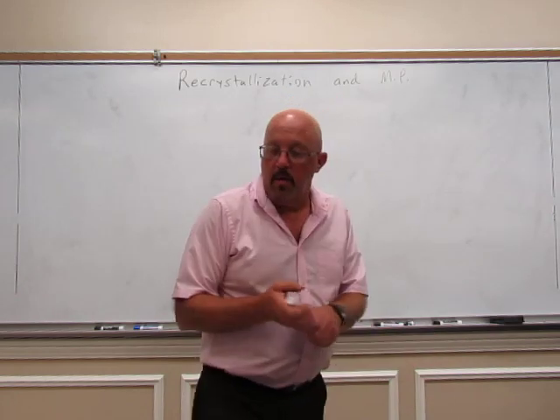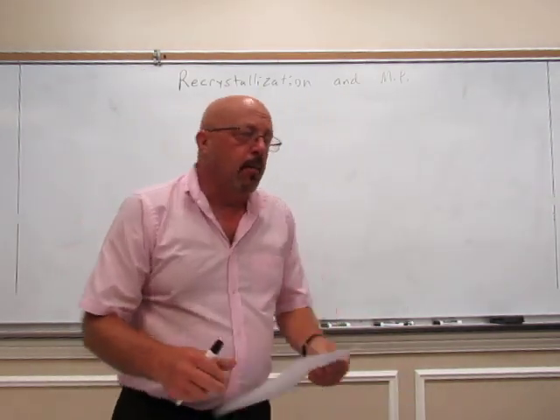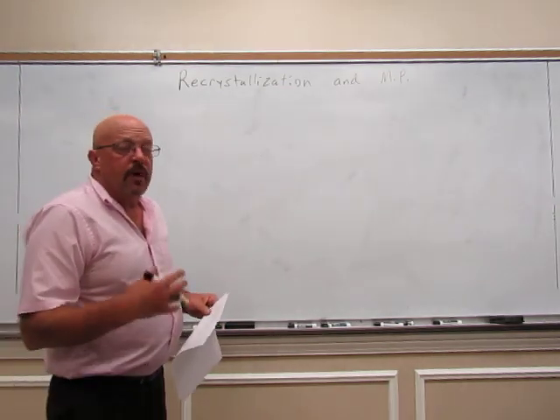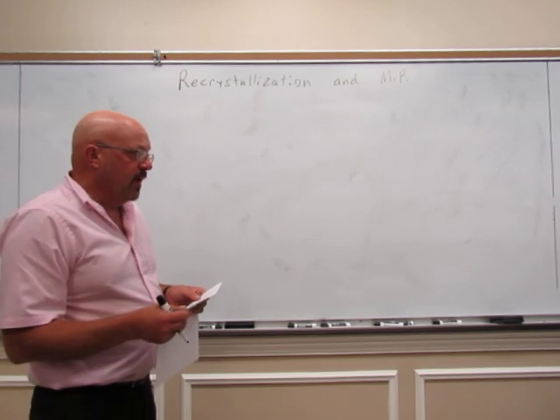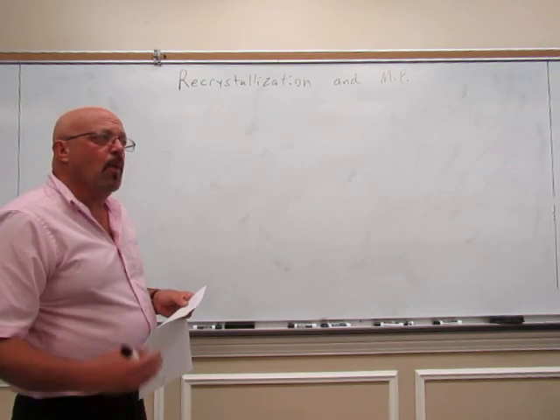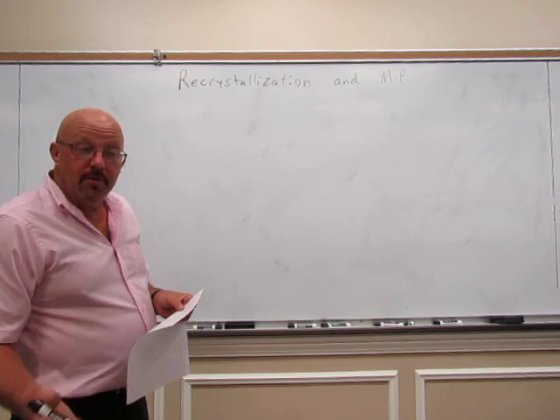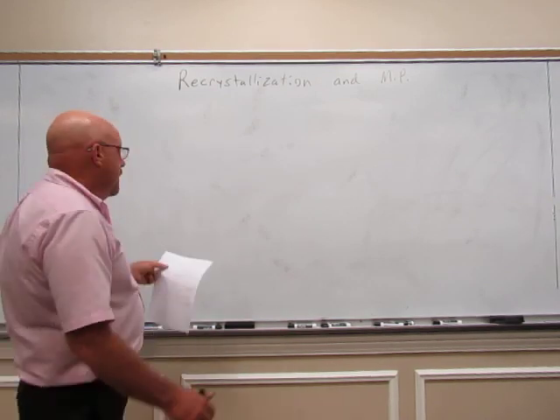This week in lab we are doing recrystallization and melting points. Recrystallization is another purification technique. We've done several purification techniques so far this semester, but it's another way to purify compounds. It's a way to purify solids. It must be a solid to recrystallize. We cannot get crystals if it's not a solid.